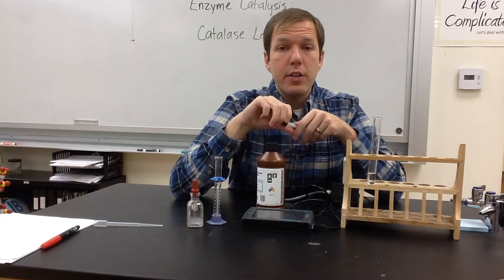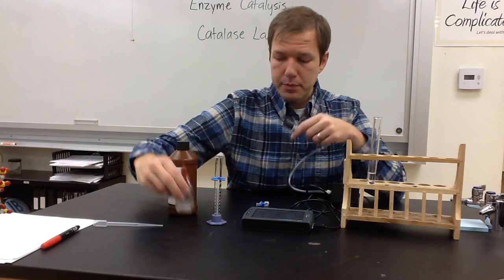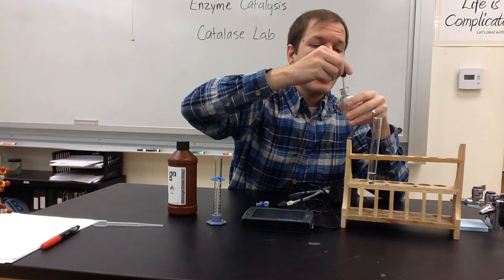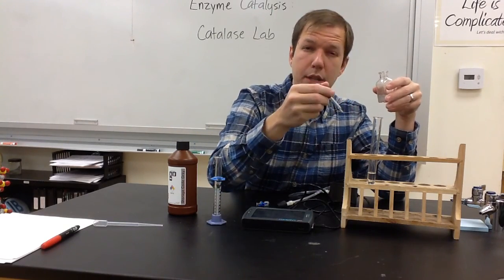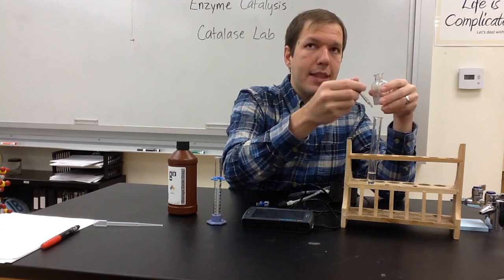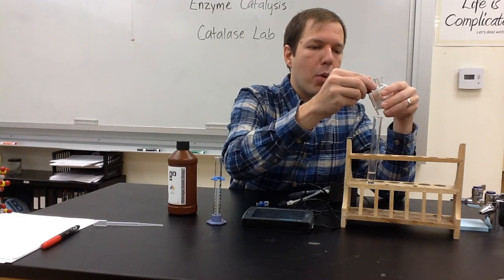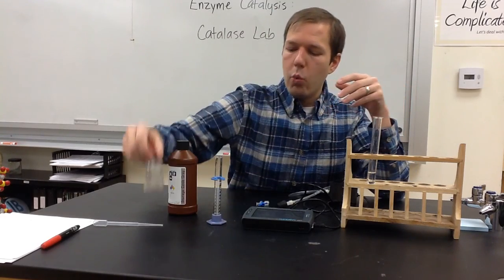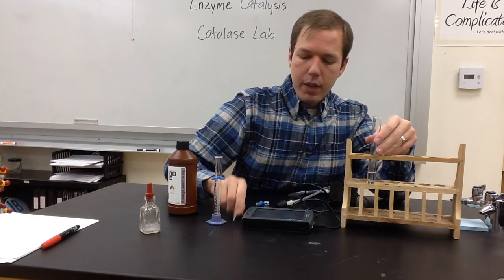When you perform the reaction, you're going to want to work together because there are three important things that need to happen. Your enzyme needs to be added, and remember, as soon as the enzyme is added, the enzyme is going to begin catalyzing the reaction and breaking down the peroxide and producing gas. So you want to be sure that you're ready to collect data. Don't add the enzyme first, only add the enzyme when you're ready to go. You'll add in the appropriate number of drops. Each full drop should be about, sorry, 1/10 of a milliliter of liquid.